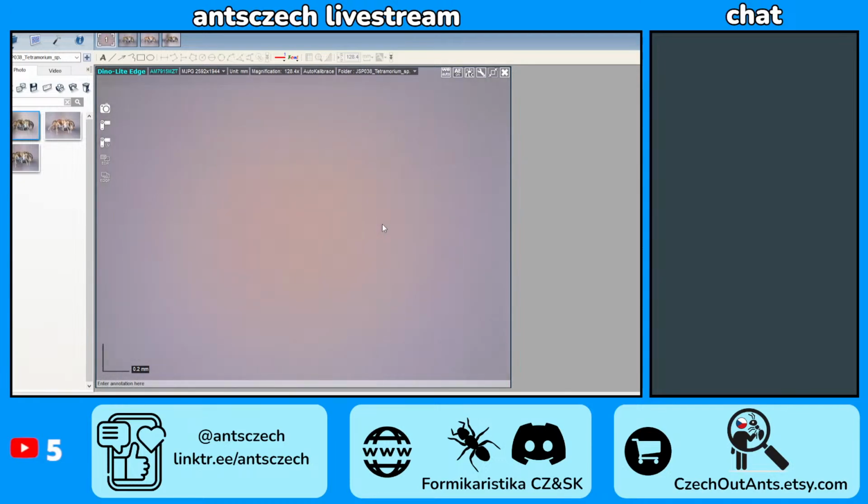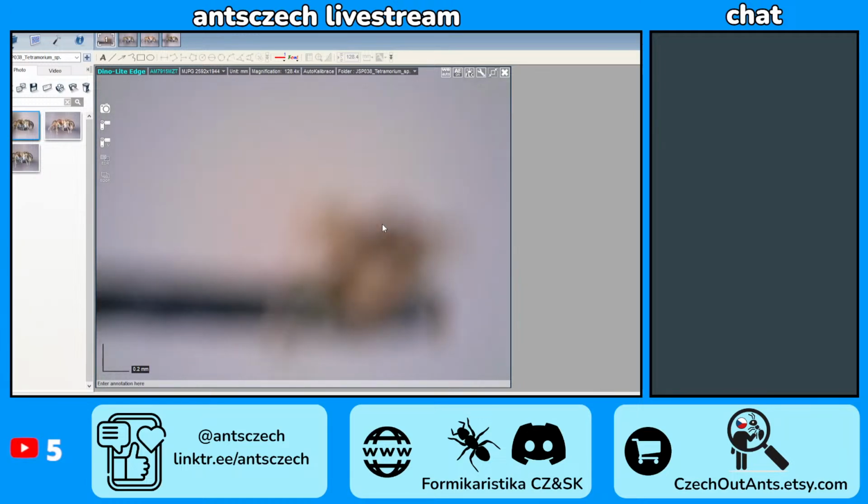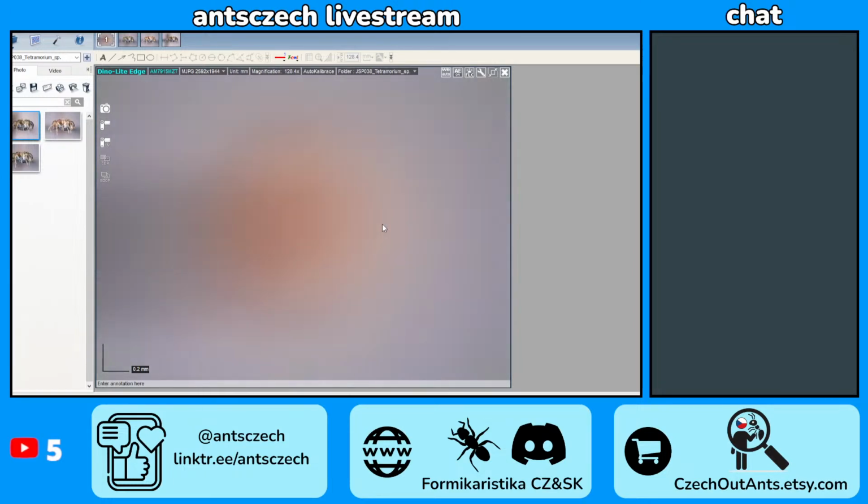Let's make a photo of the head. The question is, can we do it? No, we can't. Okay.